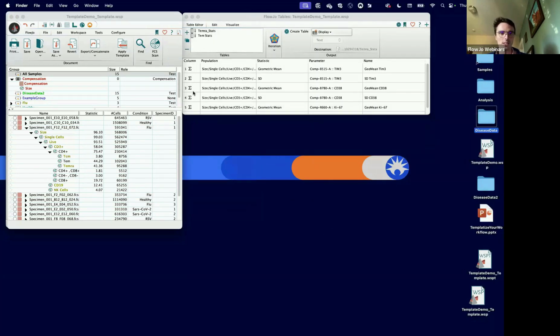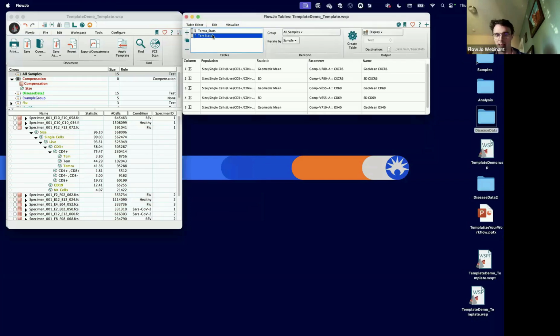You can see it just added that table to this workspace and did basically nothing else. So now I have that new table in this old workspace, and I'm able to continue forward with it ready to go. That's a neat trick if you've changed a bunch of your gates. I actually changed a few of the gates here, and I want to load some analysis from a different workspace into this one without applying the gates from that analysis or the layouts.